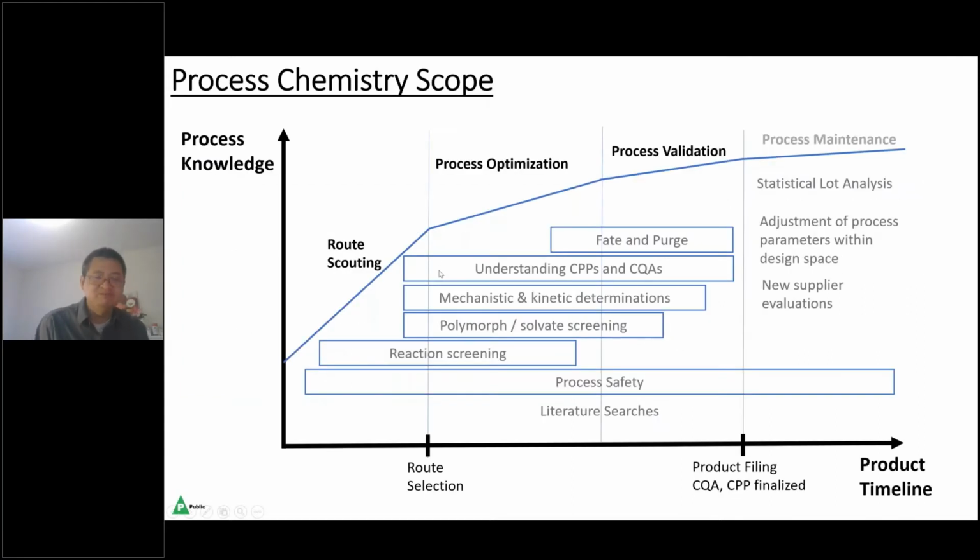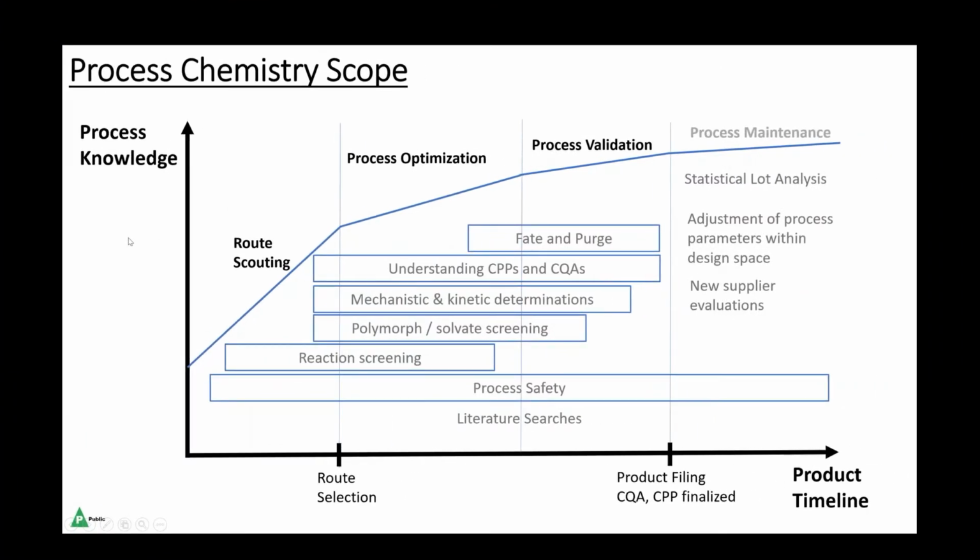Yeah, Wes, please. Thanks, Oliver. Let's take a minute to discuss the domain that we're talking about here. For those not familiar with process chemistry, it concerns the development and optimization of the production processes for chemical compounds. So that's the scaling up of laboratory chemical reactions into commercially viable synthetic routes. The key objectives for process chemistry are product quality, process robustness, economics, environmental sustainability, regulatory compliance, and safety. It's integral to any chemical product development, but it's especially well developed in the pharmaceutical industry.